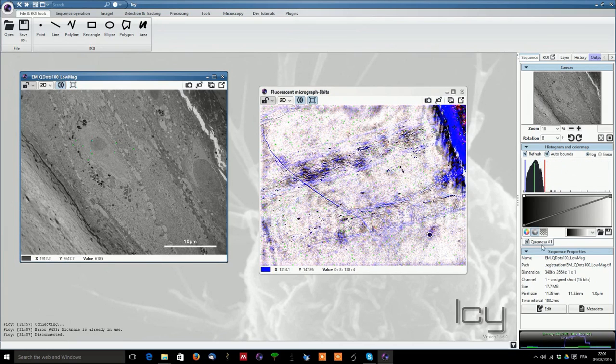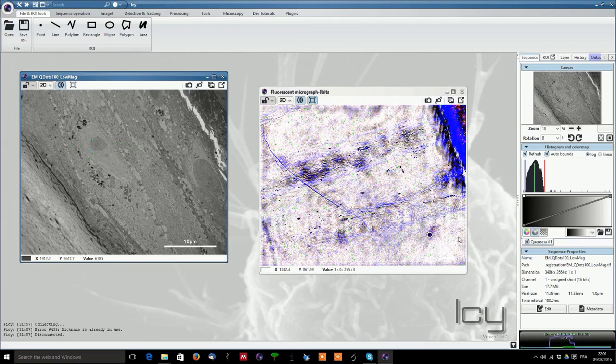Now when we look at the histogram here, we have different values and we can just play around with the histogram to have a proper display.